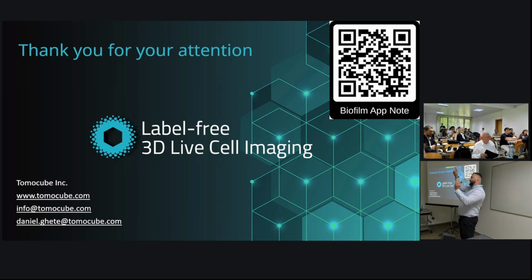The easiest way to describe it for myself is that the light comes from here at an angle, hits the numerical aperture, and then goes onto the sample. But it's a full illumination in that case. If you want to go into more detail, I'll check the paper because it's called Pepsi ODT. I don't know what they wanted with this name. It's purely efficient structured illumination optical diffraction tomography. It's a mouthful. Okay. So if you want to go into more detail, I'll give it a try.